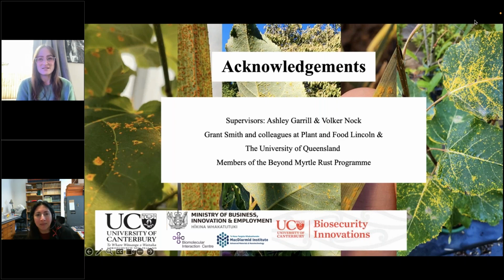But it'll be interesting to see how quickly they grow into the media. And also, if they grow really well in the 6% agar, it might be that we look at seeing how concentrated we can make that media and still have them push into it, because they tried to invade the PDMS, which is so much stiffer than agar that it was actually really impressive to see that. Could be slightly problematic in chip, but that's something we'll have to see when we can put them in there and test it. Sounds good.